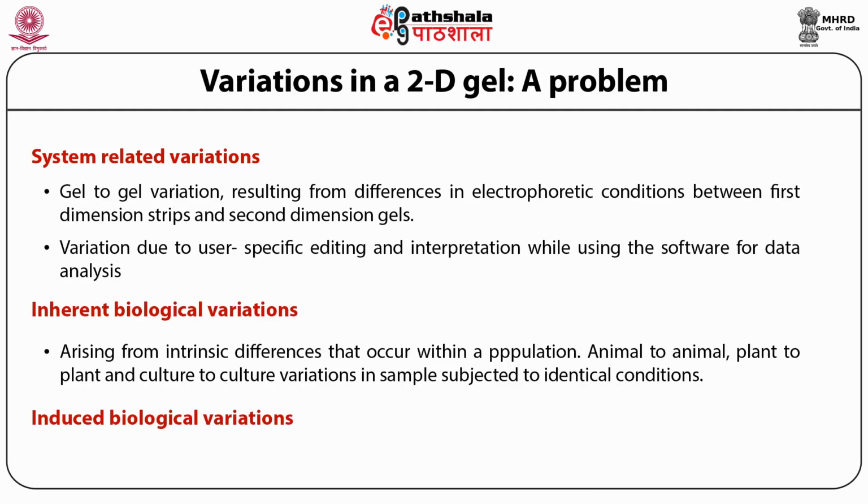This places the onus on the clinicians to collect homogeneous samples or to have patients with a homogeneous profile before categorizing them into any of the physiological or pathological phenotypes.